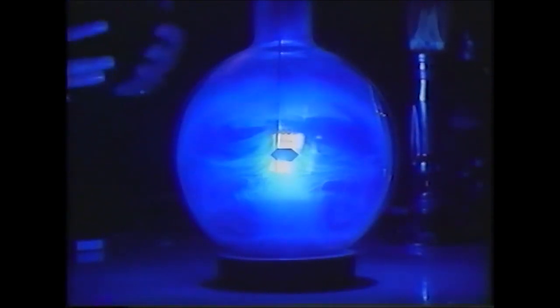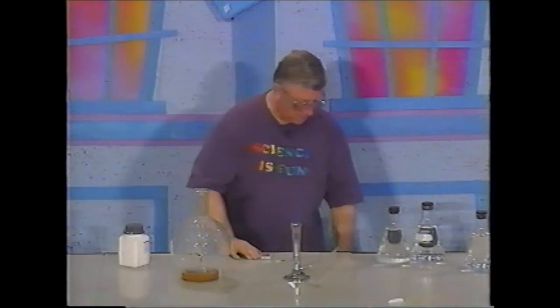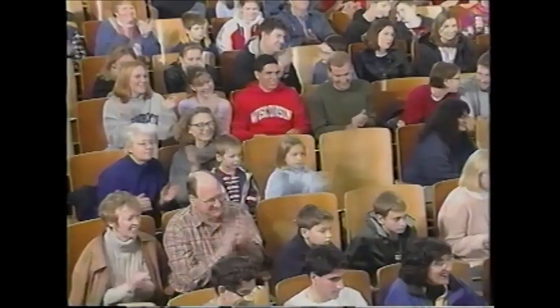You can see this beautiful glow, and it is happening this way because we have more oxygen. A lot more oxygen, and with the lights up, what happened is that the smoke kicked the cork out. So this was sealed, and I should have released the pressure a little bit, but everything is okay, and everybody is doing very well.